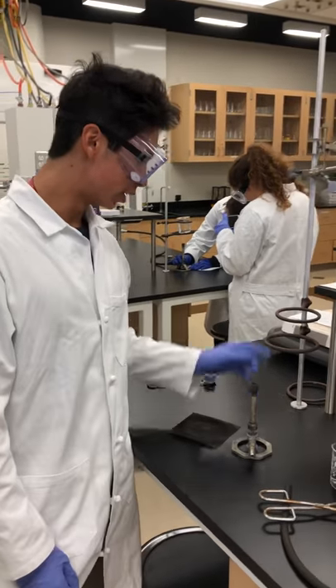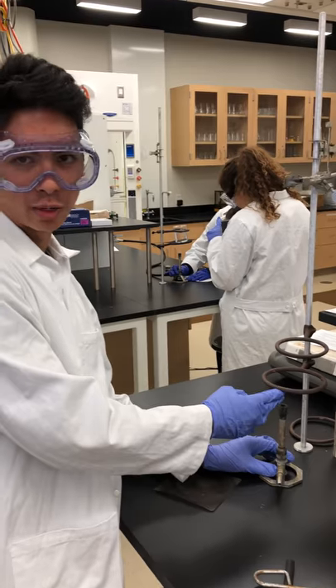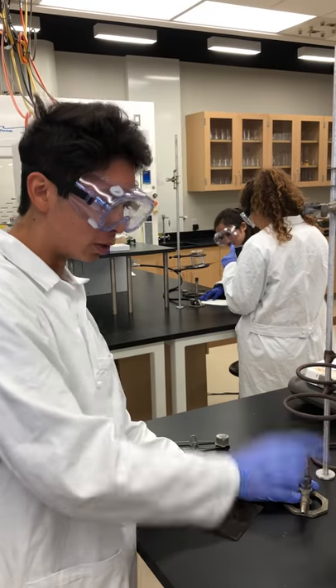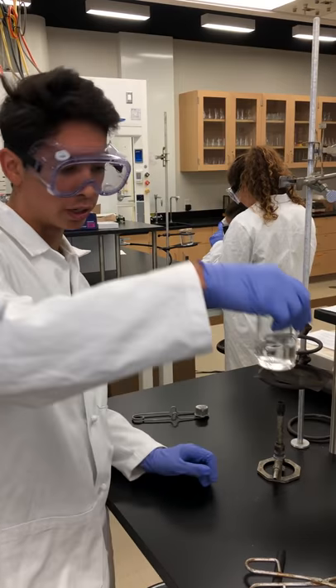So what we're going to do is we're going to set the Bunsen burner here. First, I assemble the ring stand in the clamp, which is approximately 3 centimeters, or 2 finger-widths, above the top of the Bunsen burner. Then I have the second ring stand that's about two-thirds of the way up the beaker. I'll put the wire mesh up here under the beaker.